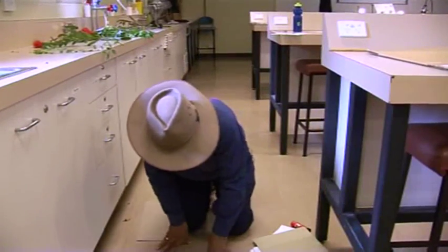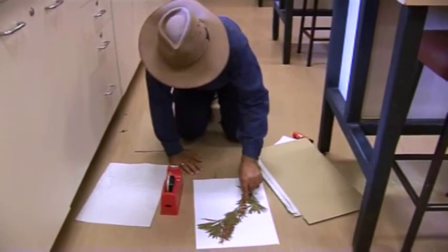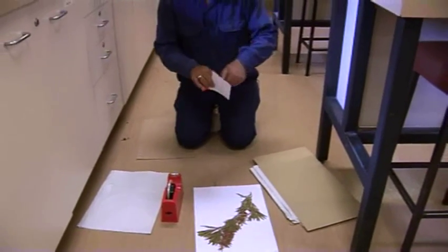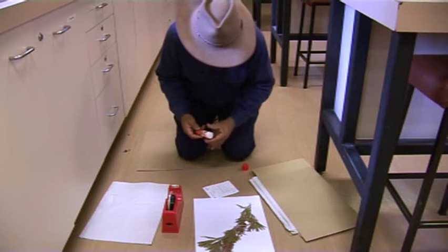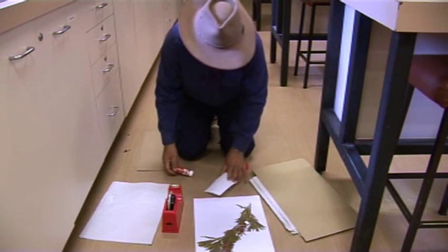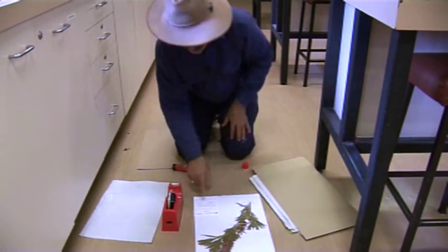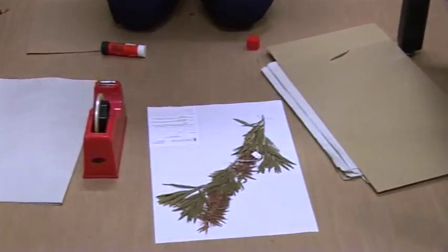So now your sample is ready, but this sample doesn't have any information except your initials and the number. So you need to stick this sheet, which has got quite a lot of information — that's the information you collected from the field — and that should go to the right-hand corner of the sheet. You can use the glue to stick that sheet. You've got the label; you need to complete that label. You can find the details on our Moodle site.